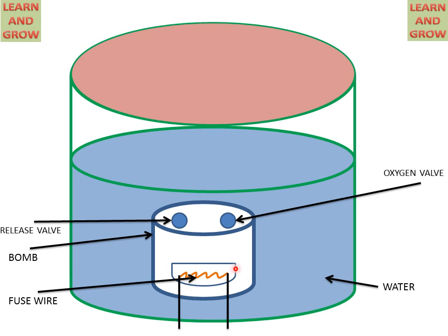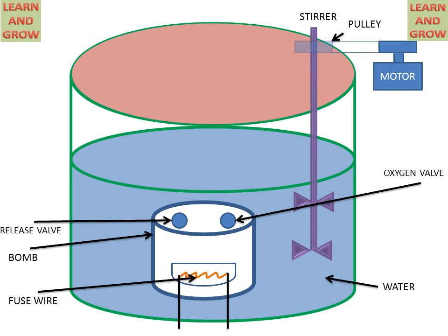These are two cables which are connected to the battery for supplying current to this fuse wire. This is a stirrer. This will help to maintain the temperature of the water at the desired point. This is connected to a motor with the help of a pulley.